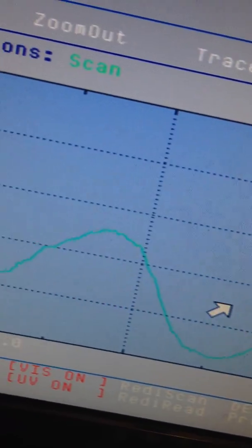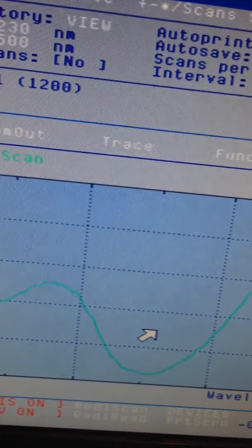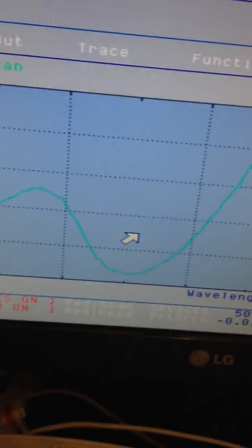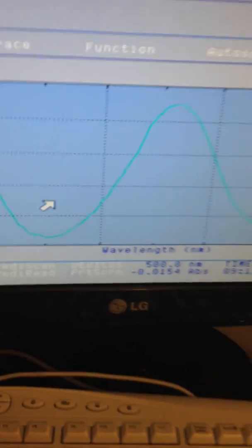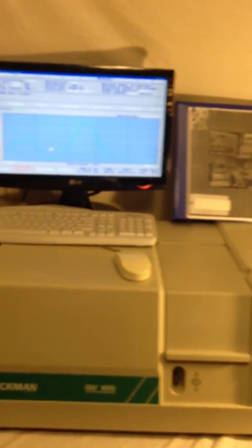This is the Beckman DU 650 spectrometer. This is the manual. You have to read all of this manual to understand exactly what to do, and happy reading.